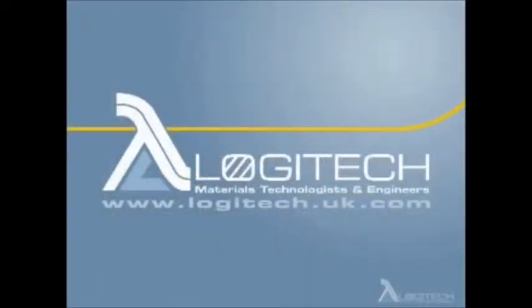All the features shown here make the PM5 an ideal benchtop solution where there is a need for a controlled flat surface with a high quality finish, whether the application is IC, MEMS, 3-5 semiconductor, or optoelectronic materials. All in all, the PM5 range is a generation of precision lapping and polishing machines offering significant refinements and benefits for all materials processing applications.